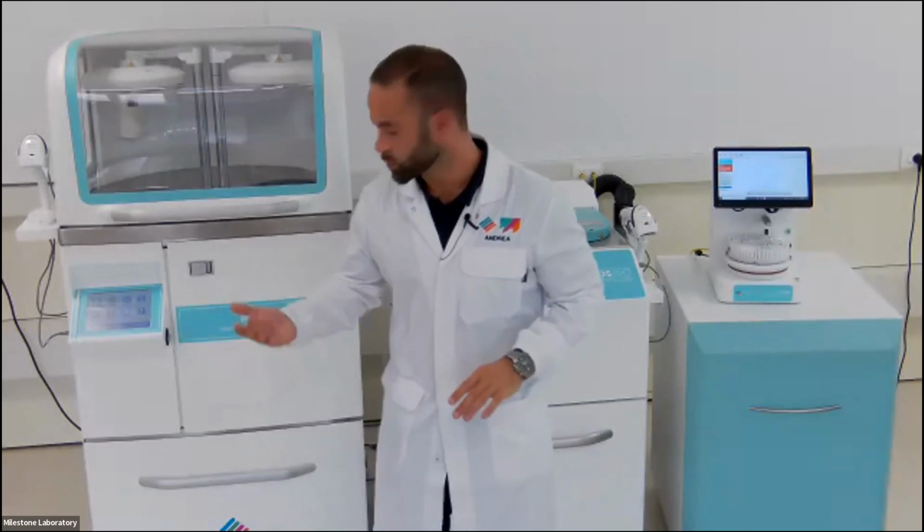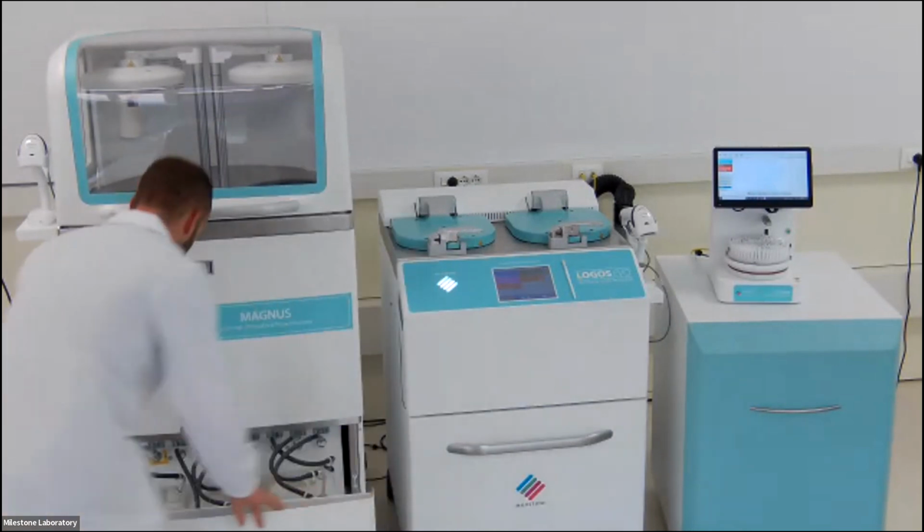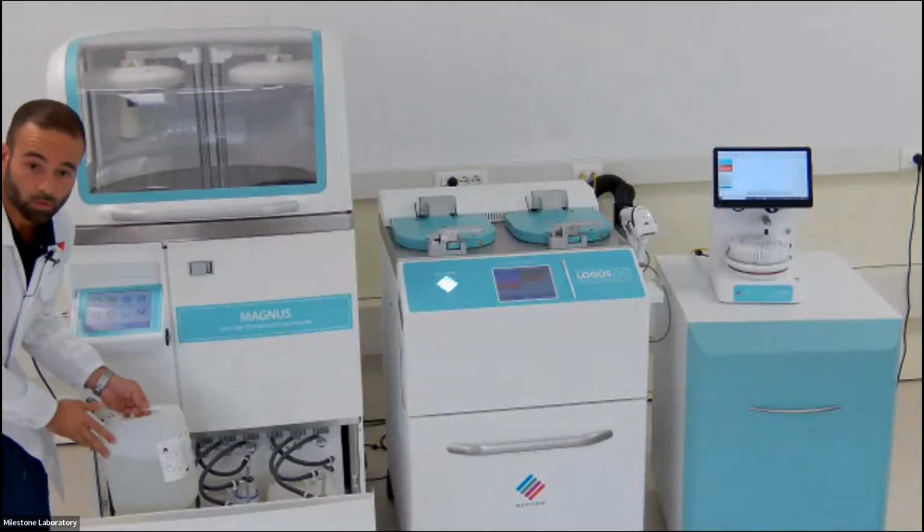Okay, now I'm gonna move to another question. Is it possible to use reagents from other manufacturers in your processors? Yes, for sure. As I showed you before, we use commercial tanks.